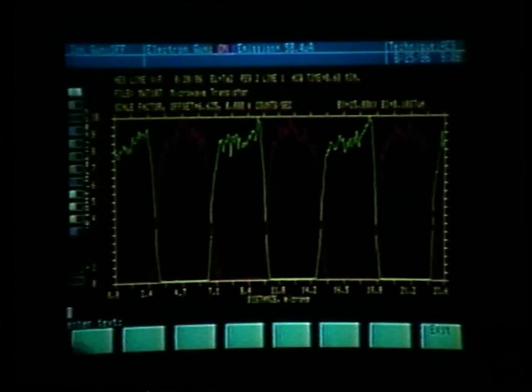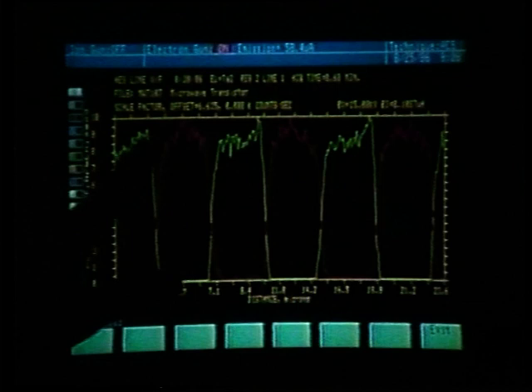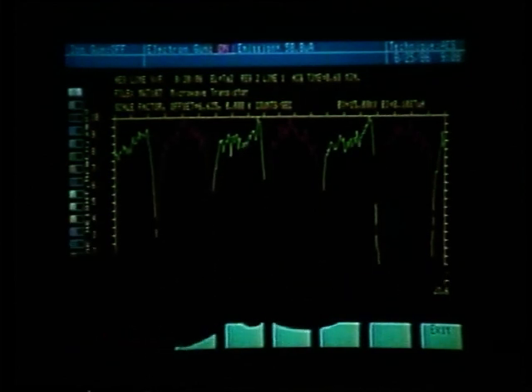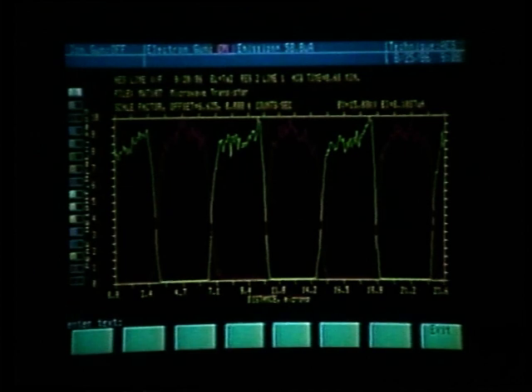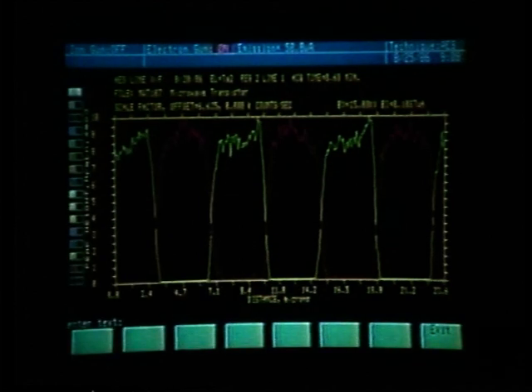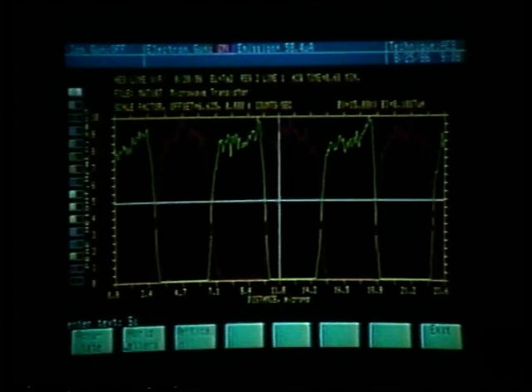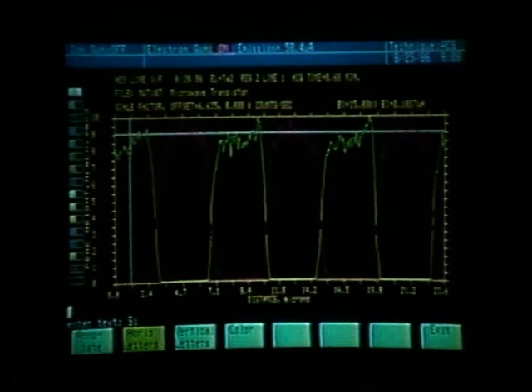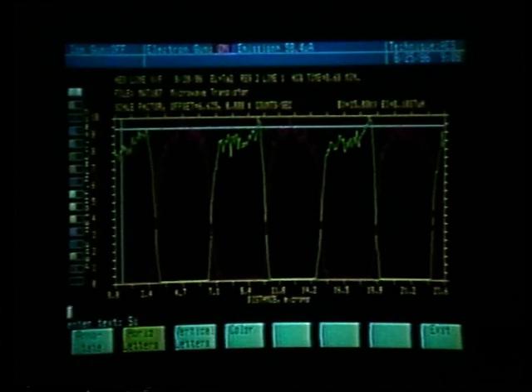We would also like to identify this as silicon, tantalum, silicon, tantalum, silicon, tantalum, silicon, because again the copy that we will be getting is in black and white and we will not be able to distinguish them. Let's then enter that text of silicon, locate it with the crosshairs, and annotate.